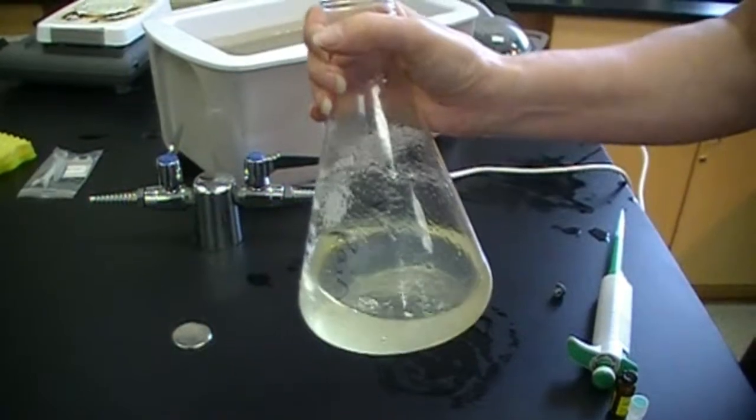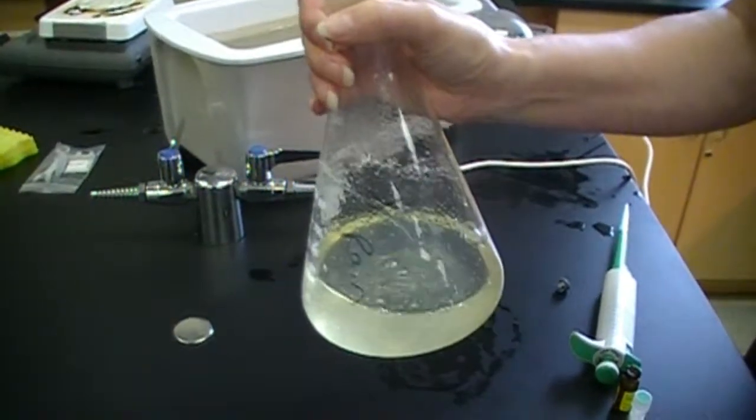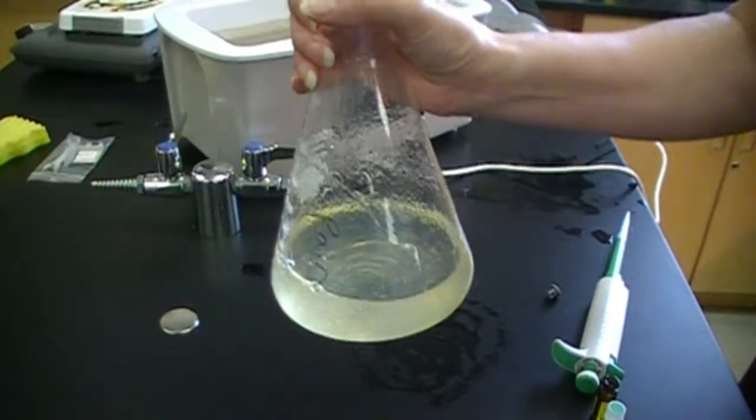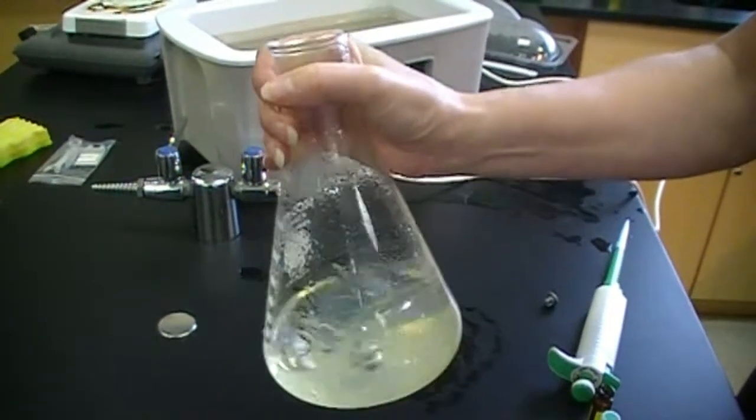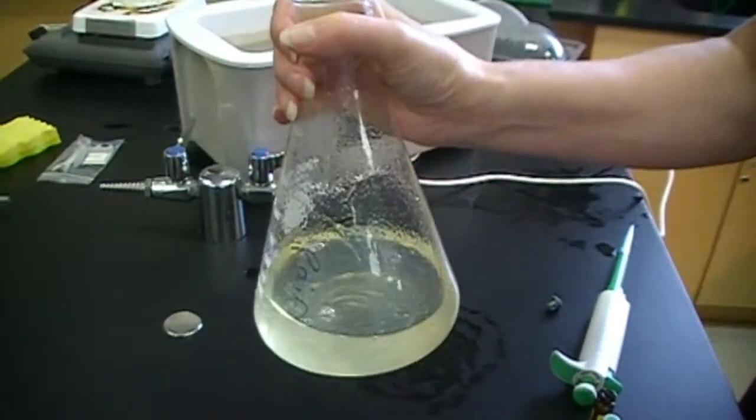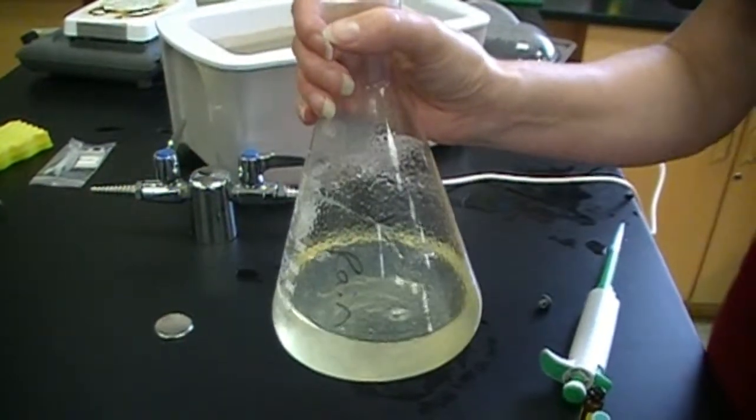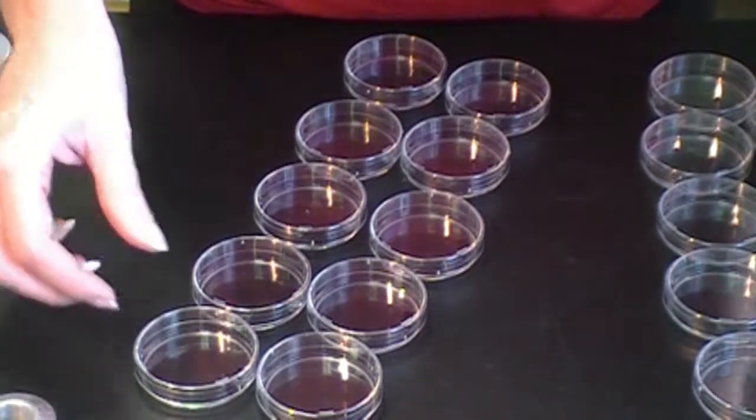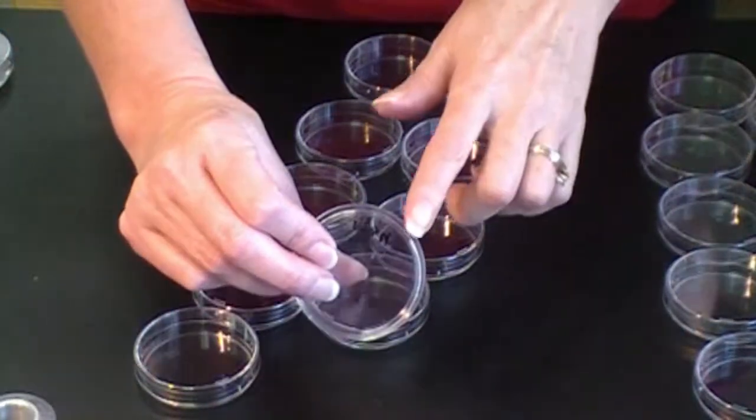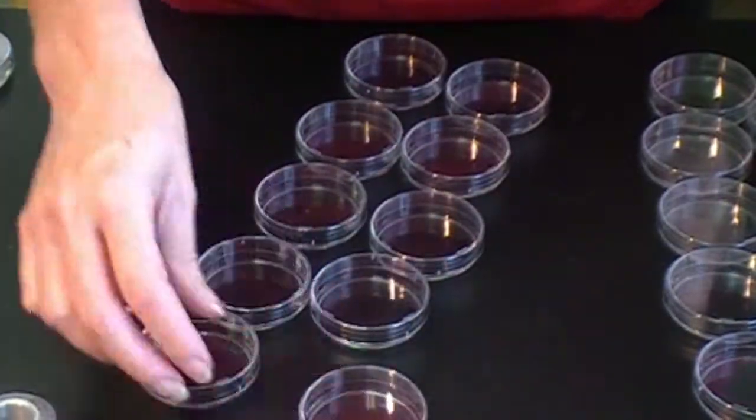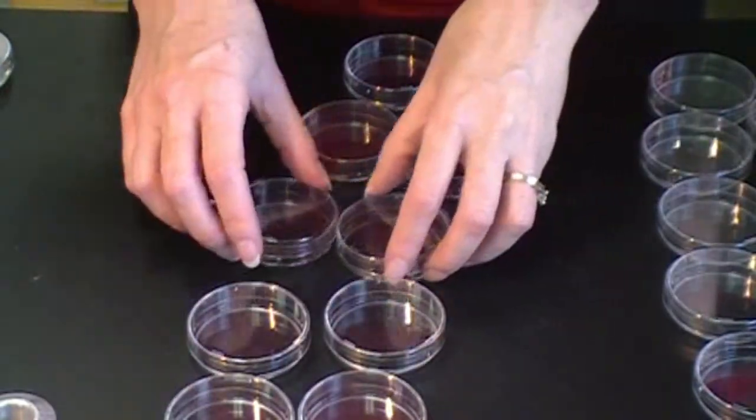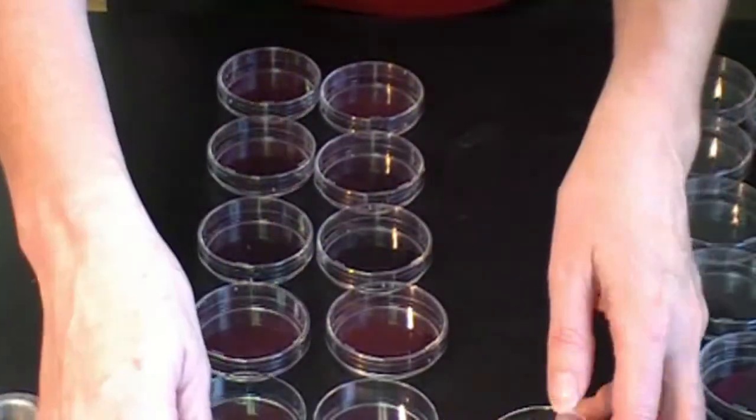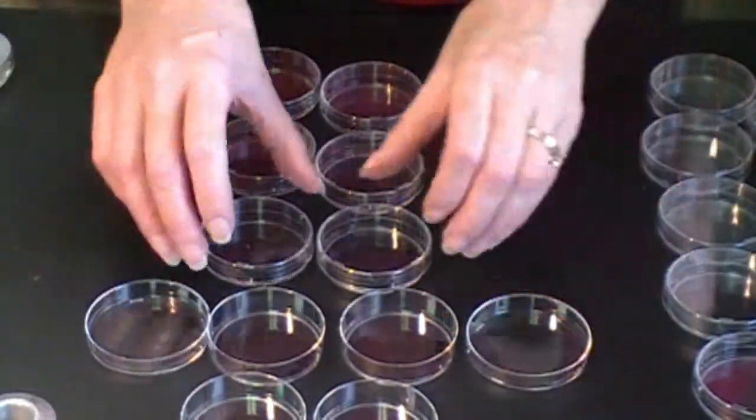And we're going to shoot for about 10 milliliters per plate. My rule of thumb is when I have enough to just barely cover the bottom, that's when I call it good. So, I'm going to head over and start pouring. Okay, so now we're going to pour the plates. As you can see, we've got our NGM on the bottom. And we're going to pour this batch all at one time. And so I am quickly going to lift the lids off and just set them right to the side.